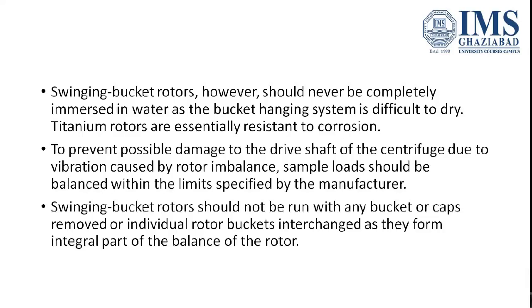To prevent possible damage to the drive shaft of the centrifuge due to vibration caused by rotor imbalance, the rotor should always be properly balanced. The sample should be loaded within limits that are specified by the manufacturer. Now, a swinging bucket rotor should not be run with any bucket or caps removed or individual rotor buckets interchanged, as they form the integral part of the balance of the rotor.